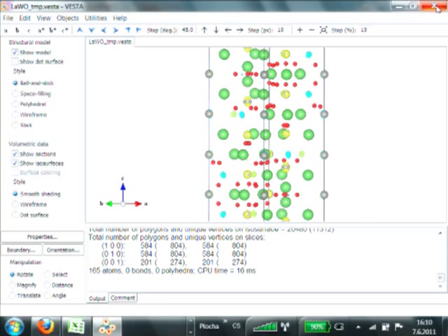You can use EDMA if you have qualitative composition and you know the number of atoms. So then you say, I have 300 atoms in my unit cell, and please distribute them between tungsten, lanthanum, and oxygen. That's a moderately strong assumption. And if you are confident about the composition, you can say, this is my formula, I want this number of atoms, this number of oxygens, and this of tungsten. So you have these 3 options. It's up to you how confident you are about the composition, and also how good quality data you have. In noisy electron diffraction data, it really helps if you know the composition. Although you can do it even without, it helps.